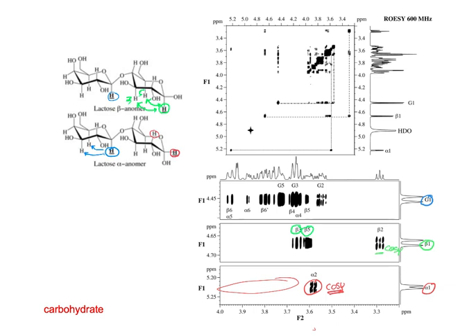So here's the main one. Here was the COSY interaction to G2 and G3 and G5. I'm not sure why they're seeing that. What is the numbering of G2, G3, and G5 in the structure?